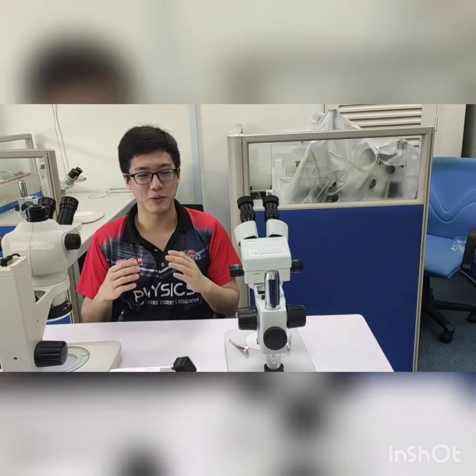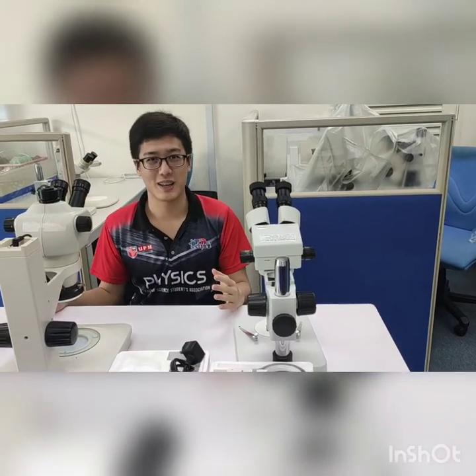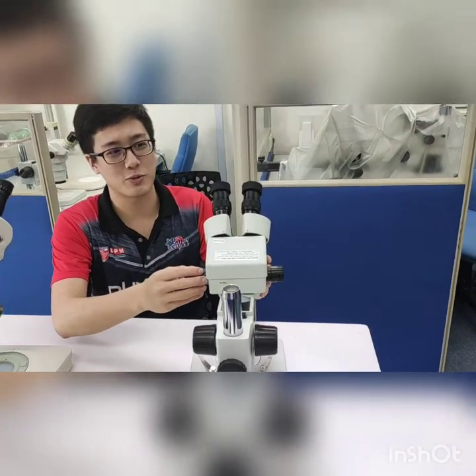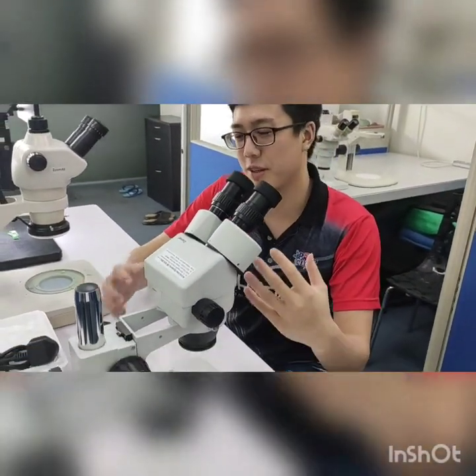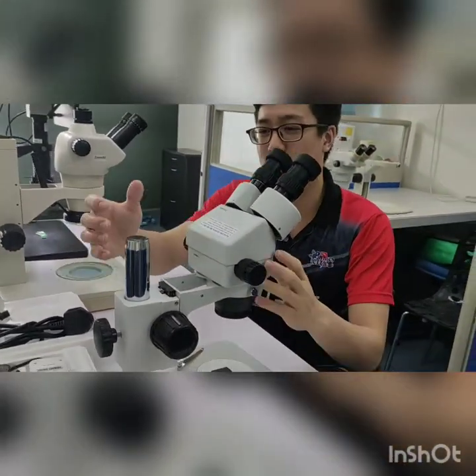So today I will be introducing everyone to different kinds of microscope, to be specific, the stereo microscope. First of all, let's look at this microscope. This first microscope is what we call a binocular microscope. When we look at a microscope, we have to understand the different parts and how we use it and their function.